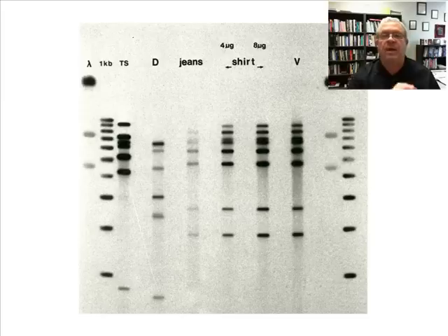But I would say, based on this one that we see right here in front of us now, that guy's in trouble. If 12 more gels match in a similar manner, he's in real trouble. We'll see how much trouble as we work through the following pencast.